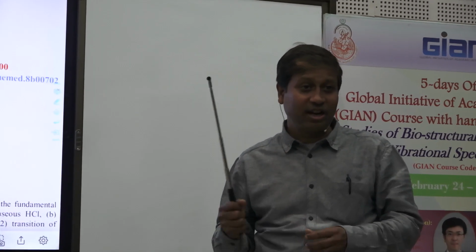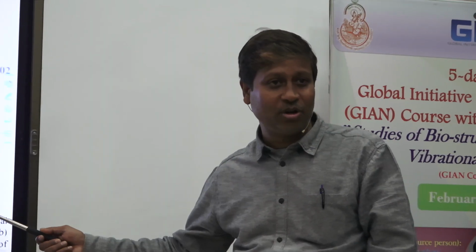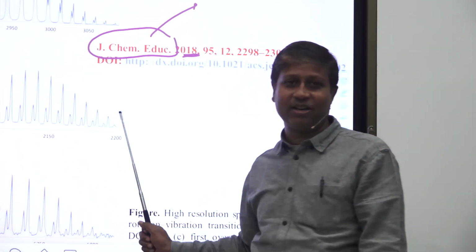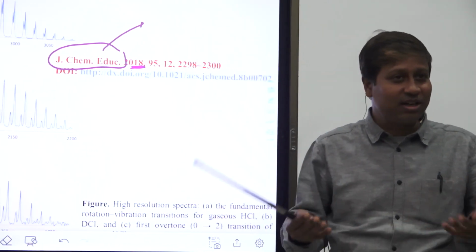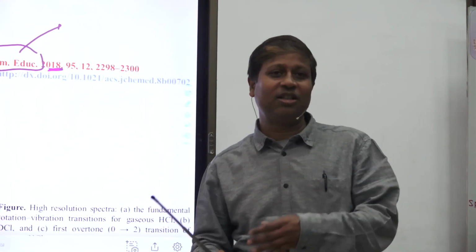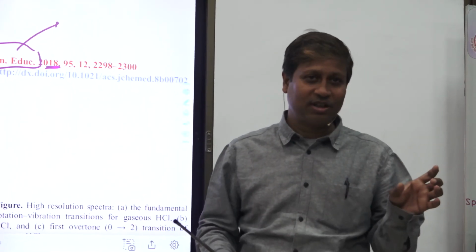So imagine they are doing work on the HCl molecule, which is supposed to be a very traditional one. The beauty of this is that whatever data they get using the recently developed instrument, that data is the ultimate. So that changes the textbook numbers.